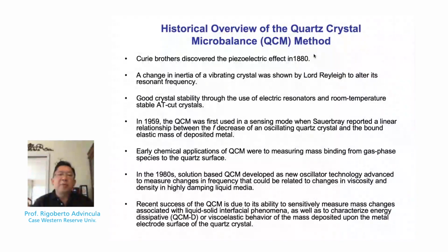Along with the ability to prepare what we call AT cut crystals, QCM is then responsible for utilizing this piezoelectric element as a method for sensing or measurement of adsorption based on the piezoelectric properties of this specific cut or type of crystal.